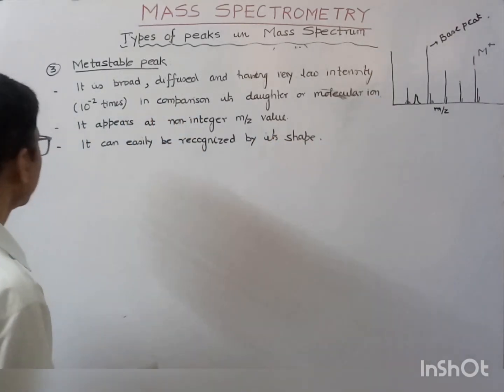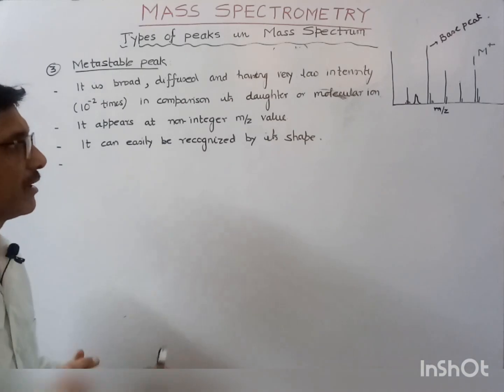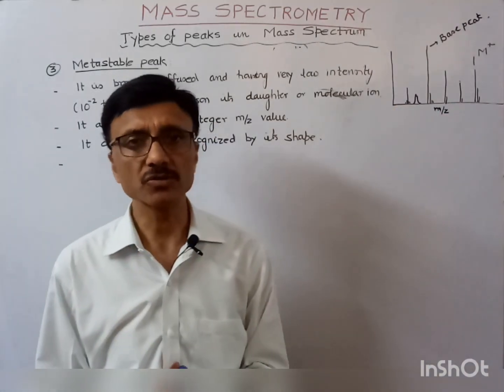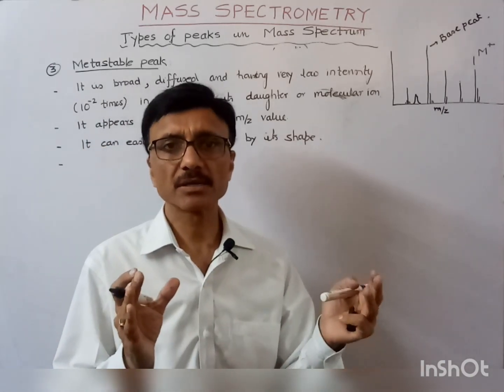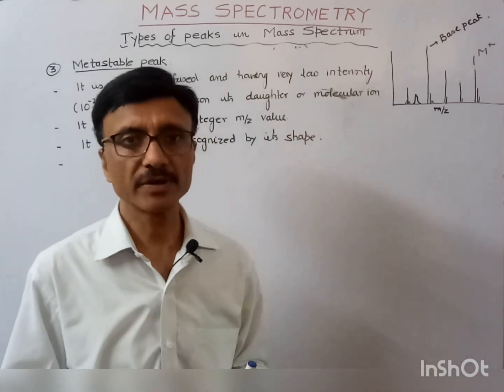If this peak is there, it may interfere with some other peaks also, so we may not get a very resolved spectrum if it is present.